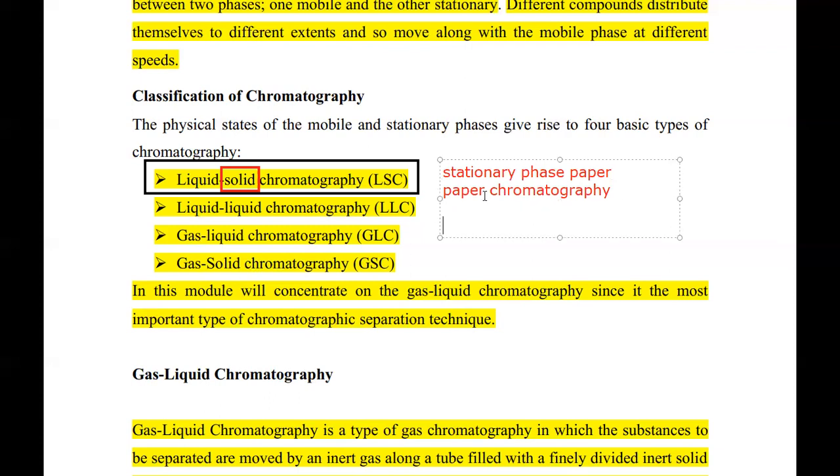And should we use aluminium foil? Now this sounds like Chinese, aluminium foil. I know when you buy Blue Band butter, there's that thing they see on top. That's a practical example of aluminium foil. Now, you see that aluminum foil cannot allow water to run through it in an ascending way. So they apply what we call silica gel. So silica gel is the one that has got the highest affinity to attract water to run through it.